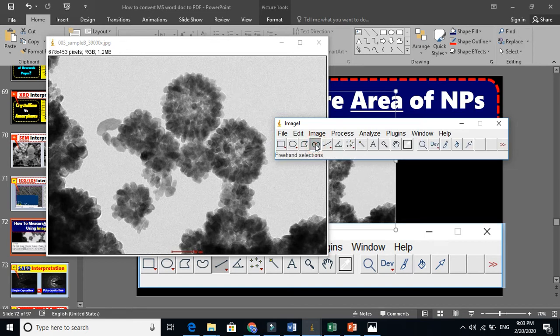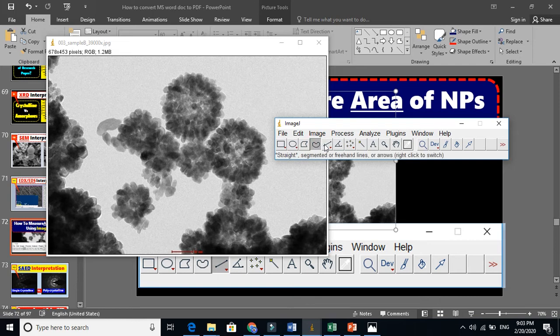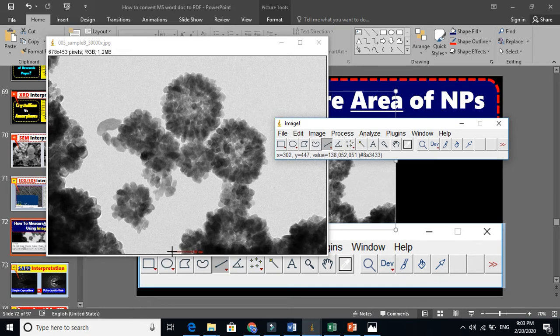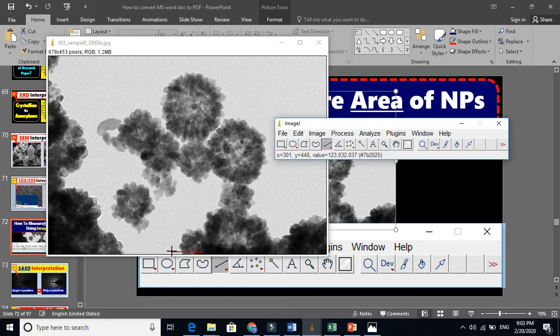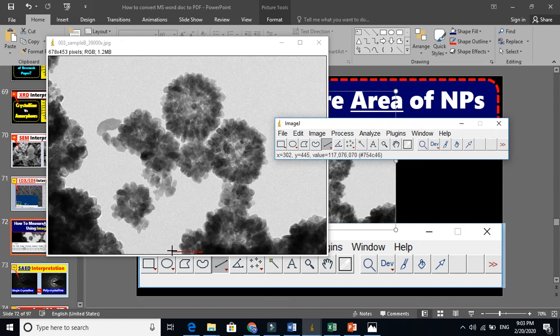But before that, let's tell ImageJ how we can measure this distance. Just set this scale and draw this scale here. You have to press Shift and draw this here.